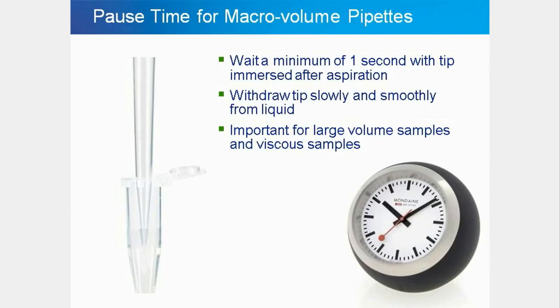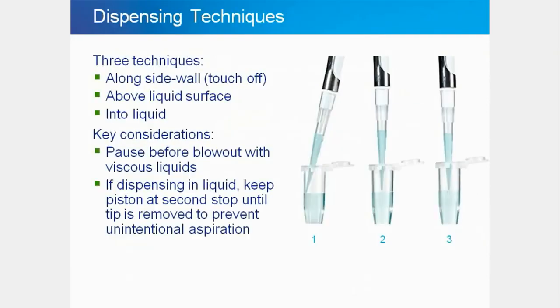Another factor is, even after you have done everything properly, the pipette is being moved about after aspiration and an air gap appears. This is just settling of the air interface, which acts like a spring and will not affect the accuracy of the sample.